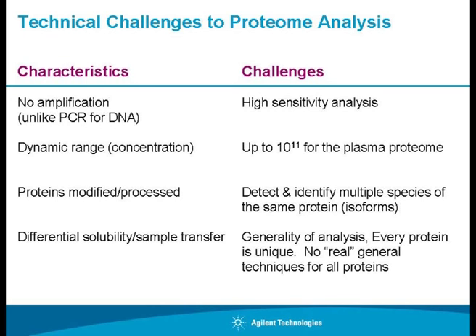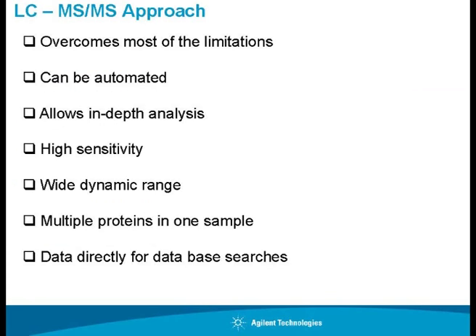And differential solubility. So, generality of analysis: you cannot generalize for this type of tissue sample, this is the method. It may not be true for other types of analysis, okay. So that is how it is complex. To overcome that, we follow the LC-MS approach, which reasonably addresses most of the challenges, okay.